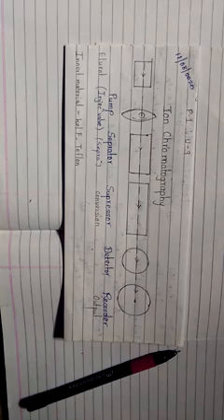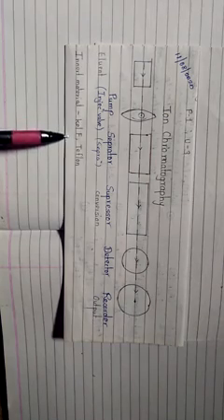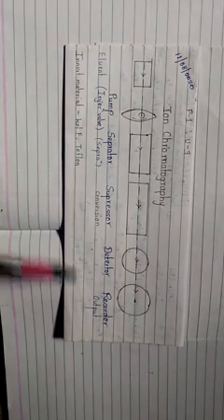I forgot that. Here for the column, the inert materials which are used are KEL-F and Teflon, and polypropylene is also used.